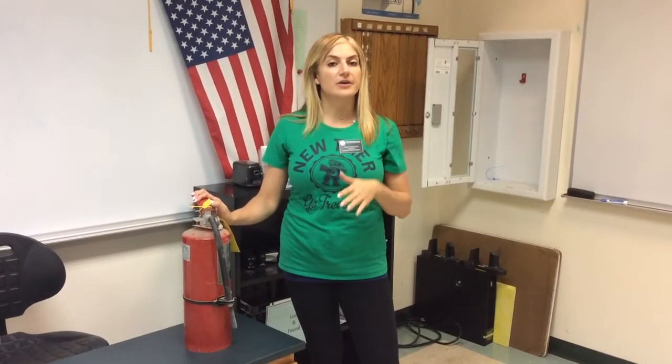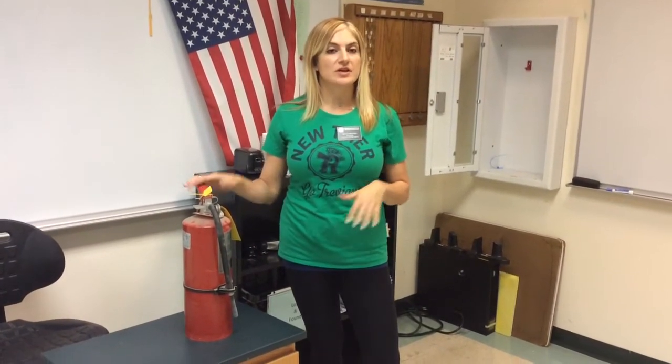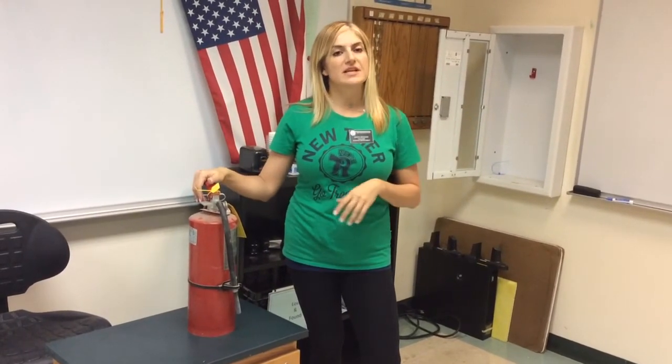Something you should not use the fire extinguisher for is glassware. So if your beaker is on fire, do not use the fire extinguisher. It's too powerful. It'll make your glassware spew all over the place and it'll be more dangerous.